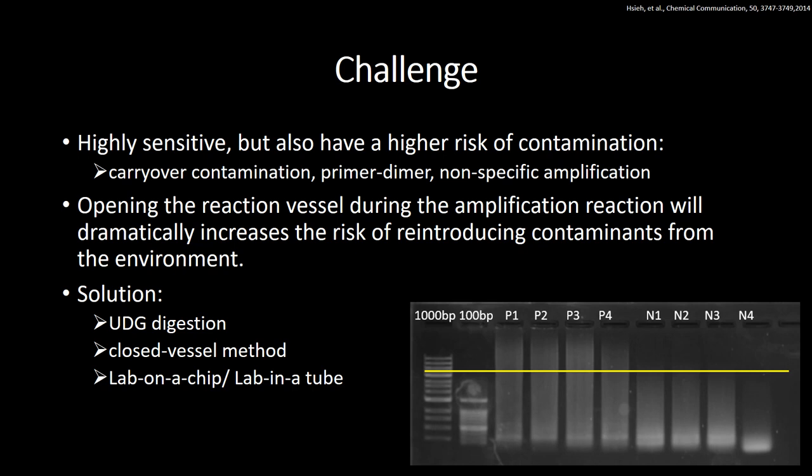However, after conducting lots of experiments, it reveals some challenges we have to face. LAMP's potent amplification mechanism, while making the assay highly sensitive, also renders it highly susceptible to carryover contamination, wherein amplified DNA products from previous LAMP reactions become templates for re-amplification that might lead to false positive results. We can see in the figure of the results of GEO that it shows some non-specific amplification on negative controls, which means that there's contamination in the environment of the laboratory due to previous LAMP reaction.